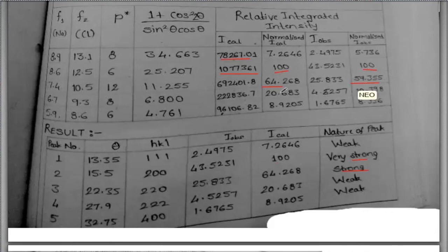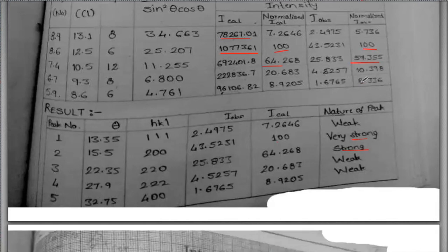So they are comparable. But in certain cases, sometimes this happens that from calculation you may get some 64% peak, and from observation you may get a very low response, a very weak peak, 8% or 7%. So in that case, you will have to think about the theory and the observation. Okay, so that will be the question.